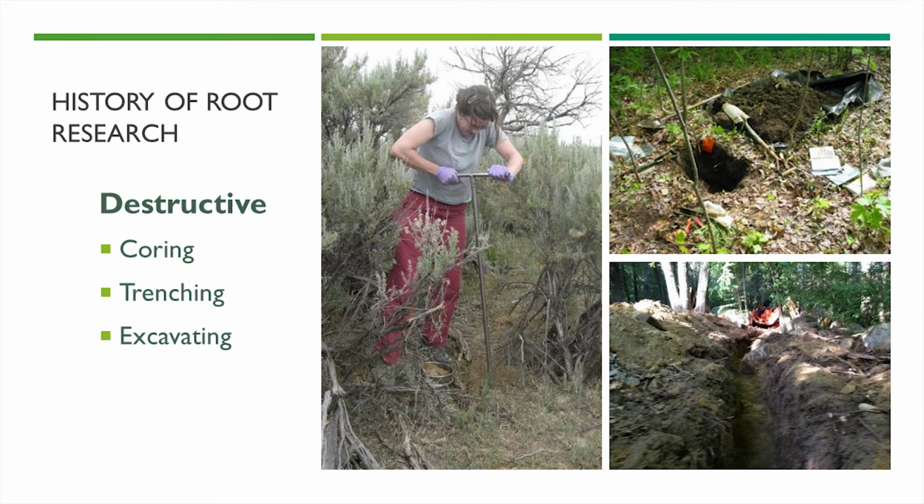Side note here, the large, beautiful images of roots in this portion of the presentation were captured by these instruments. Traditionally, root research has been drudgery. Destructive mechanical methods are still quite routinely employed, which leads to the loss of most fine roots as well as a lot of important structure information.